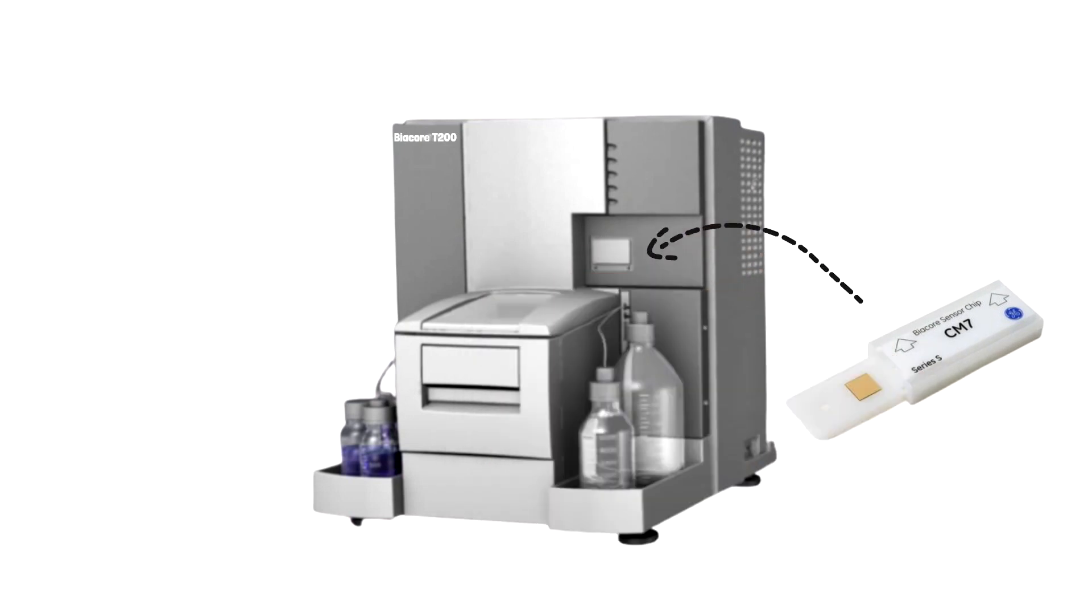The samples and reagents are held together within the instrument and are delivered to the chip by a microfluidic delivery system. This system also supplies the sensor chip with buffer and removes waste from it into the bottles attached to the instrument.